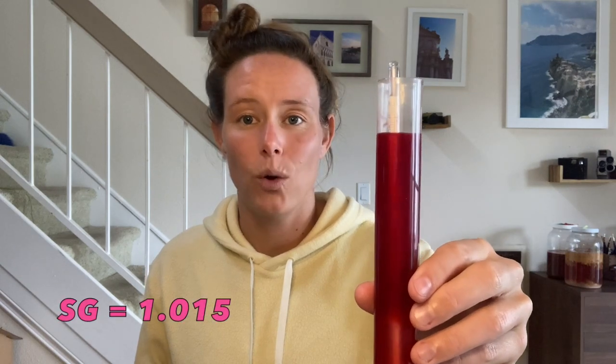And I started this wine about a month and a half ago. The starting specific gravity was 1.066. No sugar was added to this, so this just came from the pomegranate juice itself. And right now it's sitting at 1.015. So it didn't ferment out completely, but that's all right. Those wild microbes did a pretty good job.